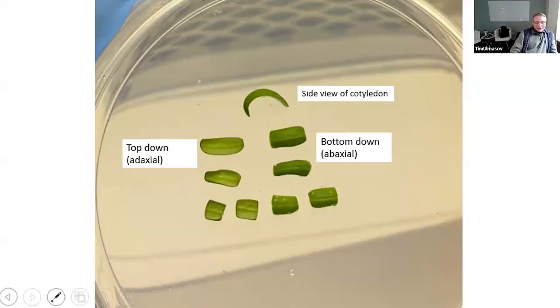That's awesome. My last question is about the transformation cycle. I think the slide was very useful: from infection on the plate to harvesting mature tomato fruit is 6 months. Obviously everyone wants to shorten that cycle. What ideas are being explored to do that? Well, to me, maybe trying in planta methods and getting away from tissue culture.